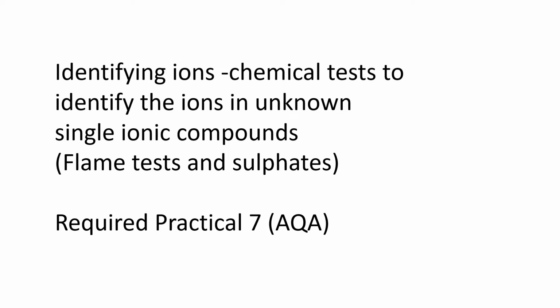Hello, in today's video we will be identifying ions by doing chemical tests and finding out ions in the unknown for a single ionic compound. In order to do that, we'll be looking at flame test and sulphate test. This is required practical 7 for the AQA exam board.